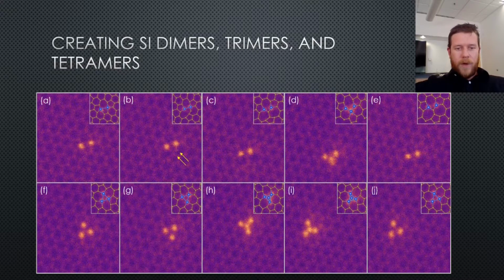material kind of like previously, and I was able to reproducibly attach a 4th silicon atom, turning this into a little pyramid. We have some DFT simulations of this, but I did not include them in this video, unfortunately. And this tetramer structure, we were also able to rotate it with the beam and knock away the 4th atom and bring it back. So all of these structures at the bottom here were interchangeable, controllably interchangeable with the beam.